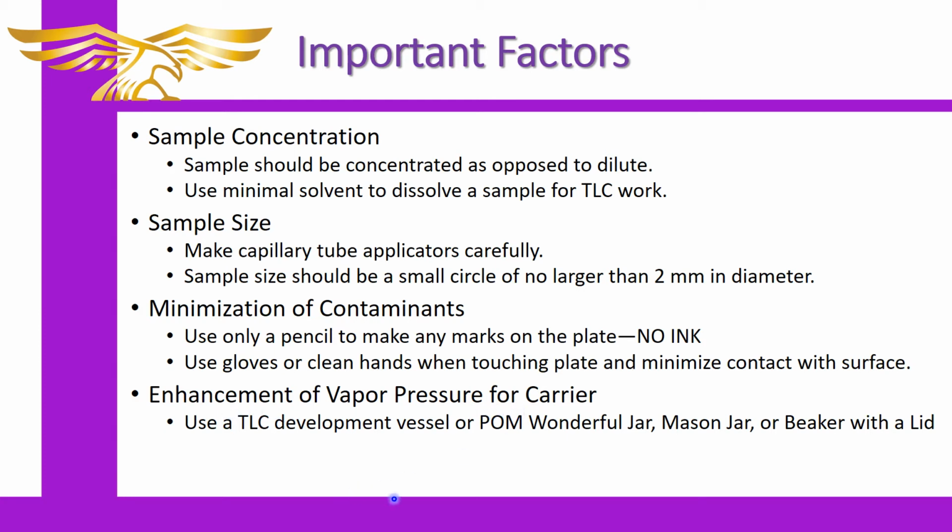The other important factor is maintaining a vapor pressure over the liquid. If you don't do this, what will happen is the solvent will favor evaporating as opposed to running through the plate. The kinetics favor whatever's the least resistant. And you have to imagine that these small spaces in the plates are fairly resistant to flow.